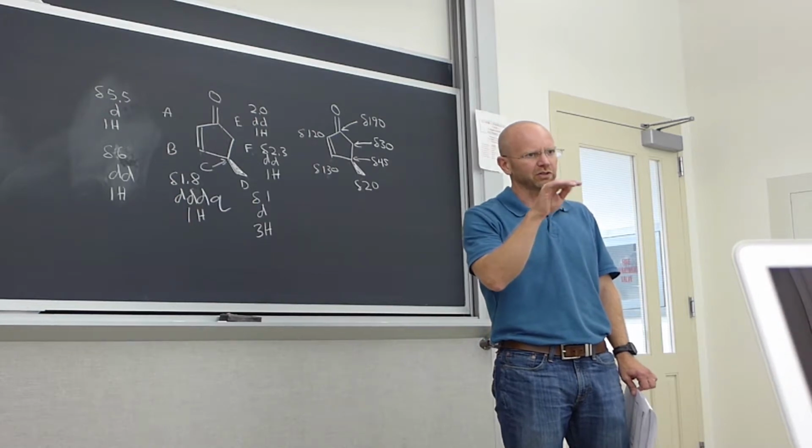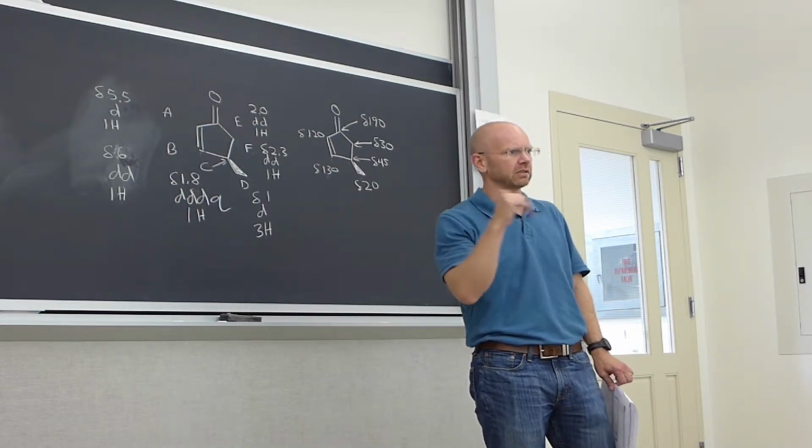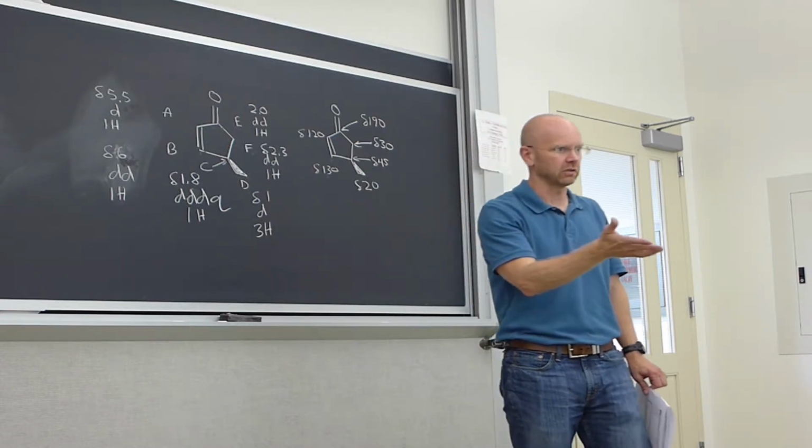And if you understand how ChemDraw represents splitting, the splittings are right. You got the correct splittings. It shows you how many splittings are there. It doesn't label them the same way we do, but you can check using ChemDraw.